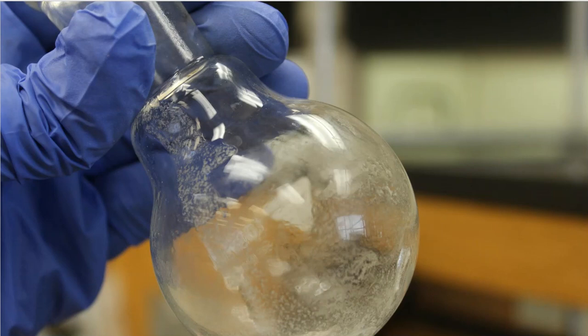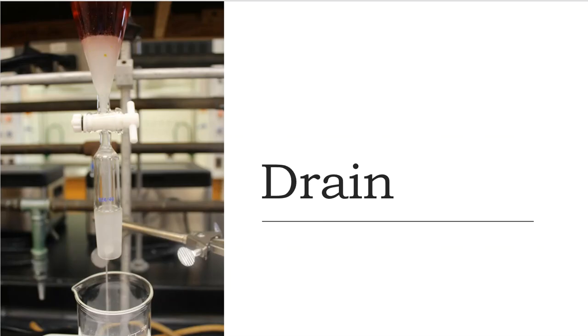If I did, that solid, chunky, crystalline-looking material that you're observing would basically be stopping up the stopcock in the separatory funnel, and that's not what I want.